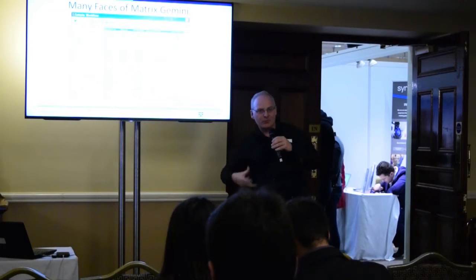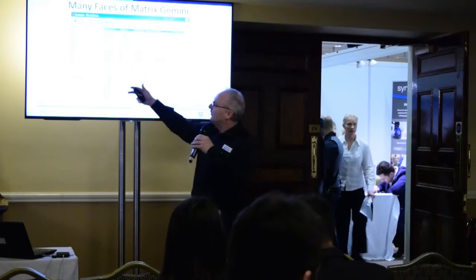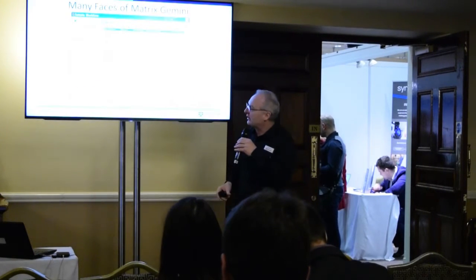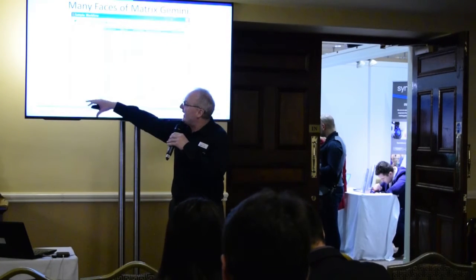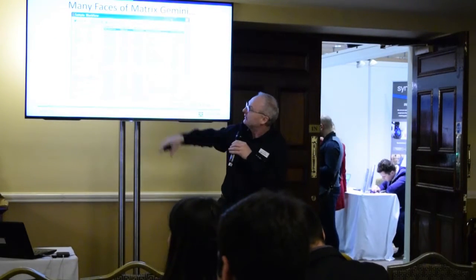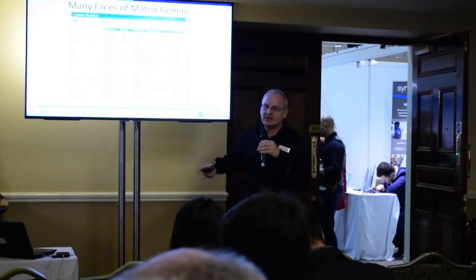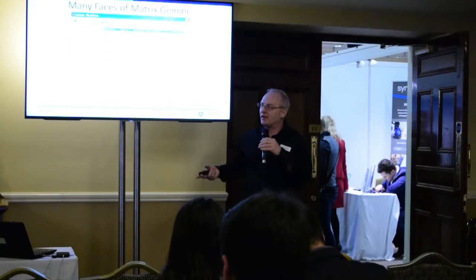The next one, some people prefer, is an all-in-one type workflow. And here you're showing all the samples, whatever stage they're at, and you're differentiating the stage they're at by the colour of the sample on the screen. So prepared will be a different red, registered will be purple, and final approved will be black. And you can see that on the screen here. So this highlights the various things which are being saved, in this particular case for each sample, for information around that sample.